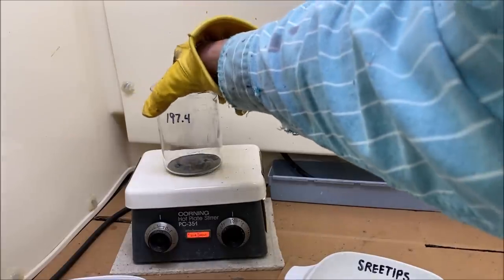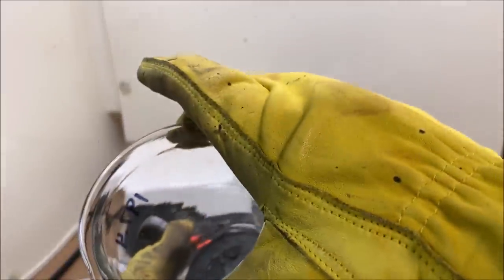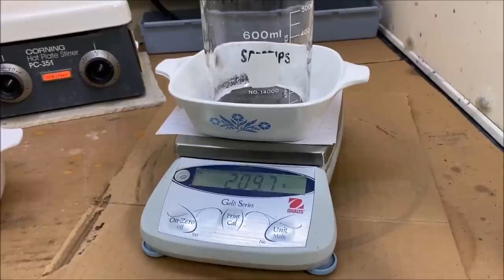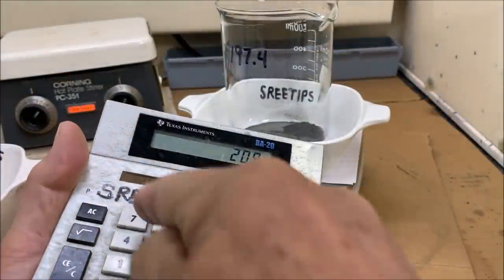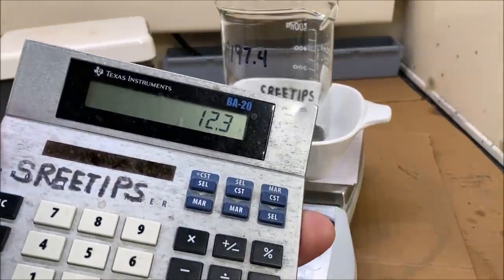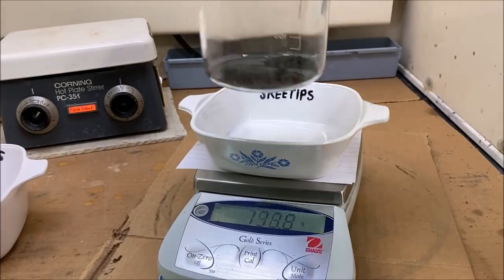Here we go. We've got everything dried off in here now. Gray powder, kind of stuck. Let's see what we got for a weight on this stuff now. Let's see, we're at 209.7 minus 197.4, so we've got 12.3 grams of platinum in our beaker.